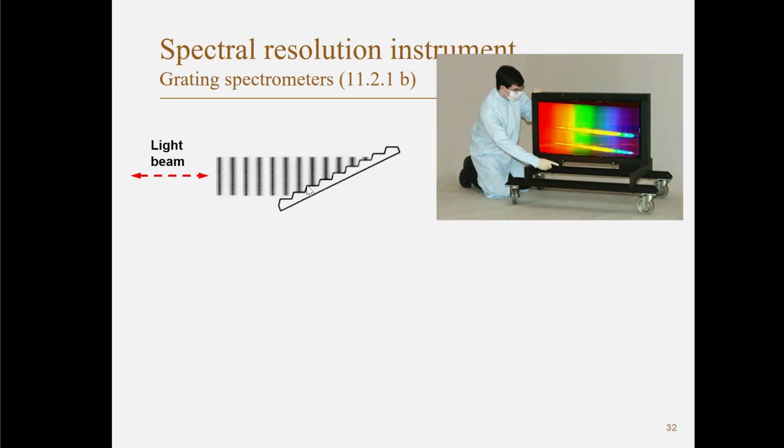So what does that mean? Well, if we compare, for example, this tooth in the grating and the next tooth in the direction of this beam, the light is diffracted from one tooth at a very large angle, because this tooth is so little that it diffracts into a very large angle going out from a single groove. And the same goes for the next groove, which is also small and diffracts in all angles.